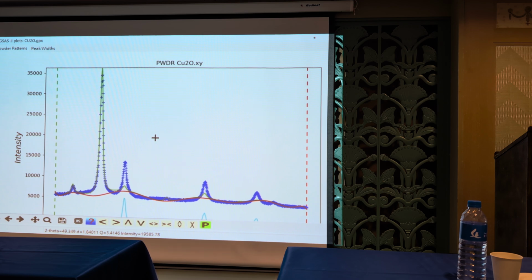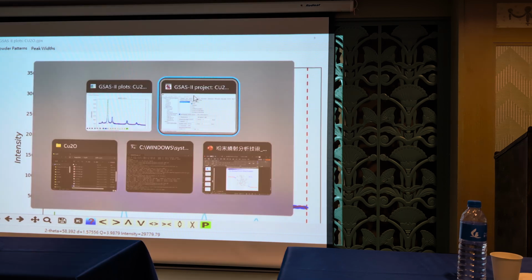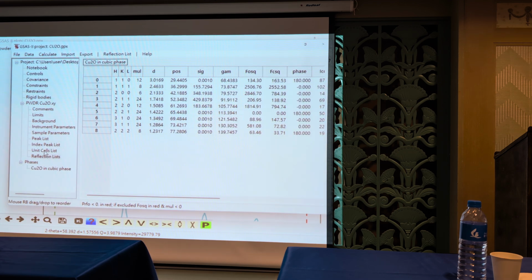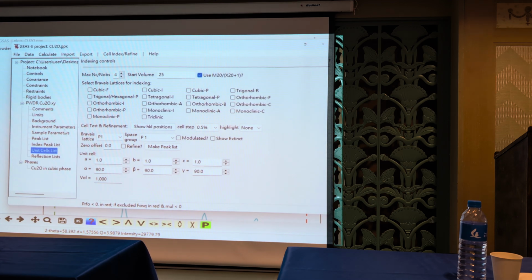Okay, good question. We can also solve this unknown phase, but you will use the function here. Okay, wait a minute. So we first, okay, just here.